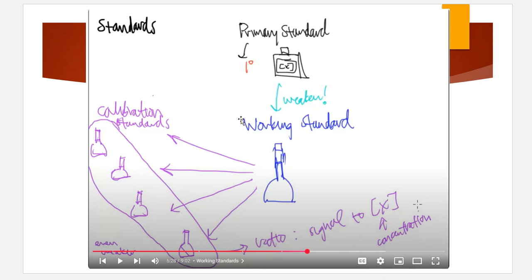All right. If this is not needed, then the primary dilution standard will be used directly to make all of these calibration solutions. They might call these the working standards. They might call these the cal standards. Whatever the case is, they make that judgment call. But this middle step here, or actually third step, is maybe not needed every time. And if not, that's perfectly fine. That is built in the SOP, and that's its rhyme, that's its purpose, that's its reason.